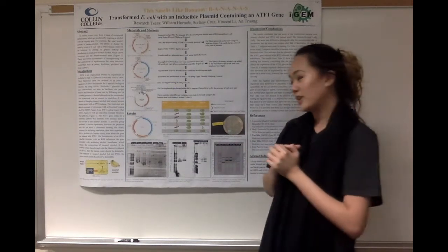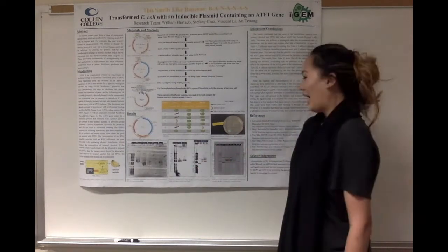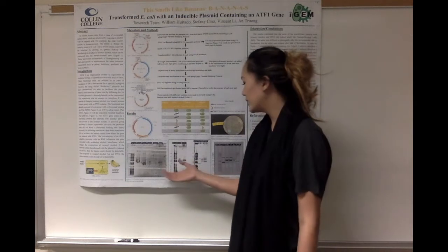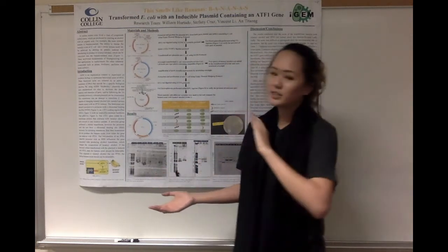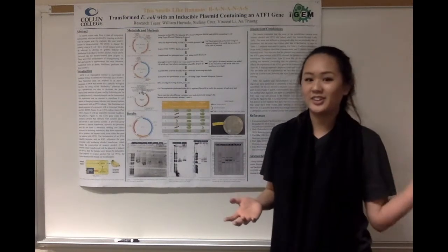We also ran this gel on uncut pieces to have something to compare them to. As you can see, our digested ampicillin-resistant backbone looks flawless, but there's a lower concentration of DNA in our Part A and Part B. This will affect the strength of the banana smell, explained later on in the results.